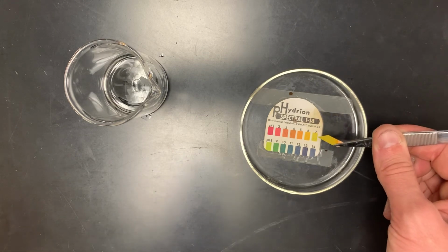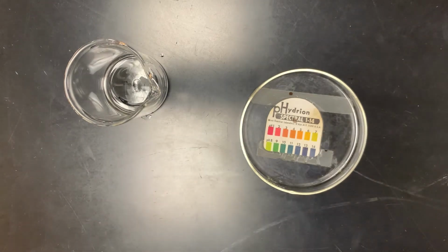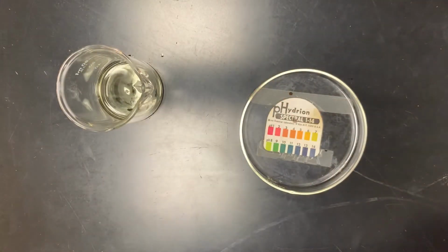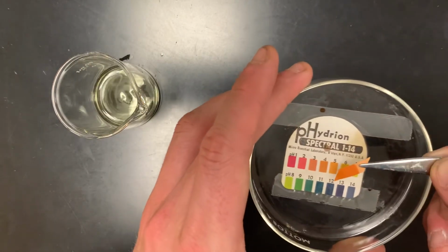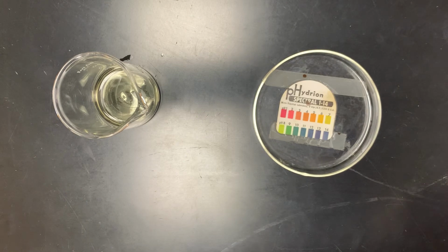So this has apparently increased the basicity of that solution. Okay. We have our potassium chloride up next, so our KCl. Kind of a cool hue to that solution. Let's take a look. It's looking to be in between maybe a 5 and a 6 there.